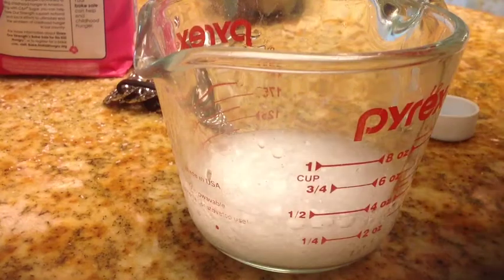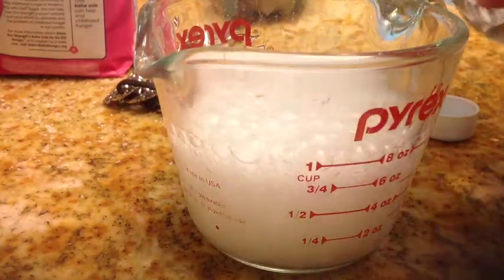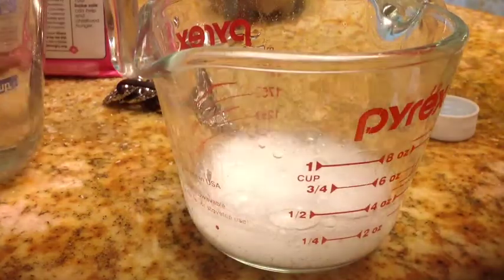As you can tell, the reaction happens at a much slower rate and much less effectively. There aren't nearly as many bubbles, and it's because the water changes the concentration.